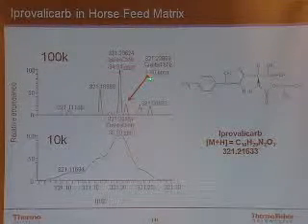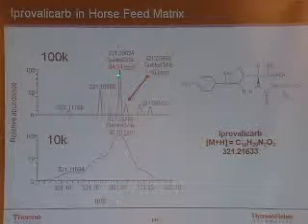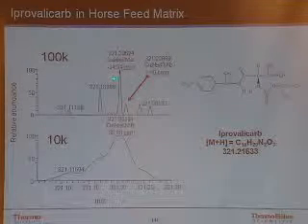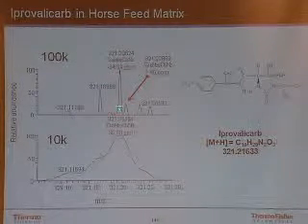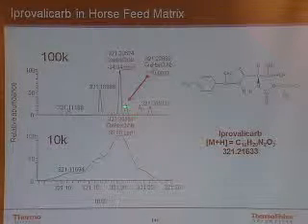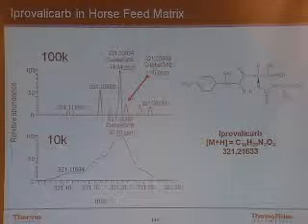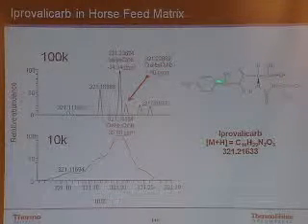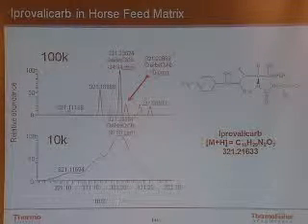And what I wanted you to see is that when you look for this veterinary drug, I tended to look right at that peak right there because I thought it was the major component. Well, it's not the major component, and I would have identified the wrong peak if I had not had the accurate mass of this peak right here. And the accurate mass there says I'm within 1.4 parts per million of correctly identifying a very large veterinary drug residue.